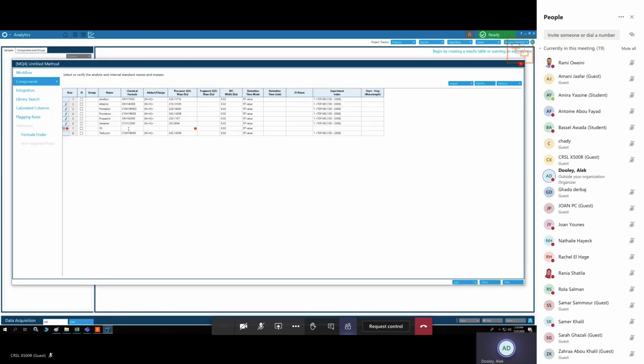I can type, for example, C5, H3, and then someone was talking about iron yesterday. No matter what you type, as long as you type it exactly like the periodic table, it will give you the charged monoisotopic mass. So don't write chlorine with a big C and a big L, because that's carbon and lithium, or not, what's L?